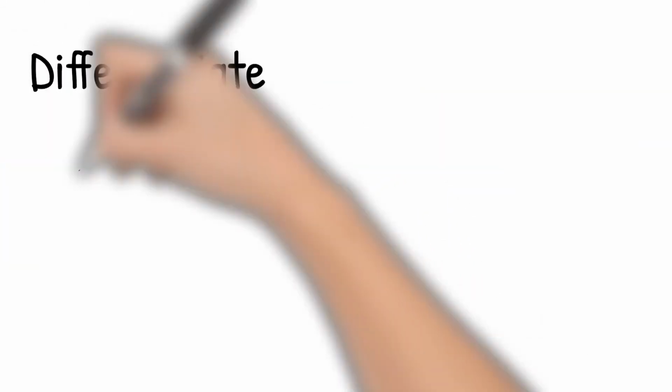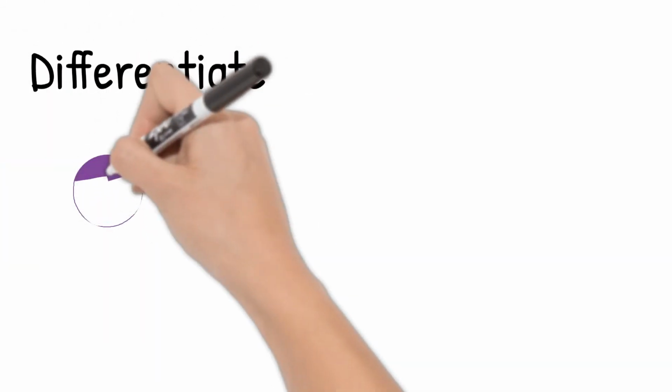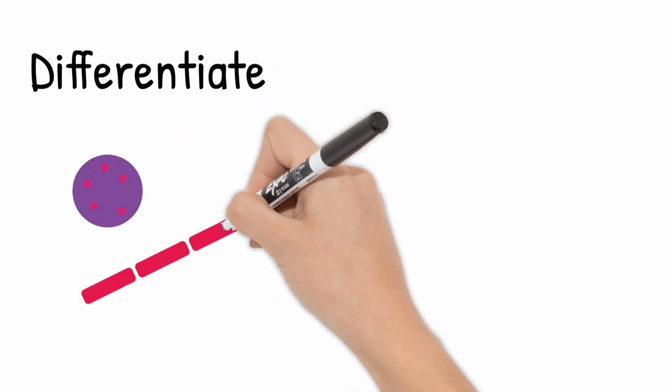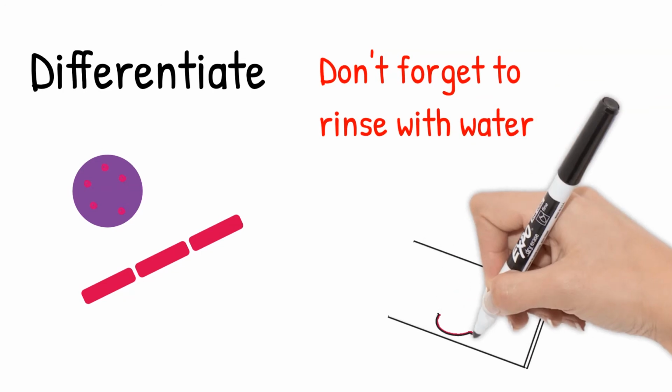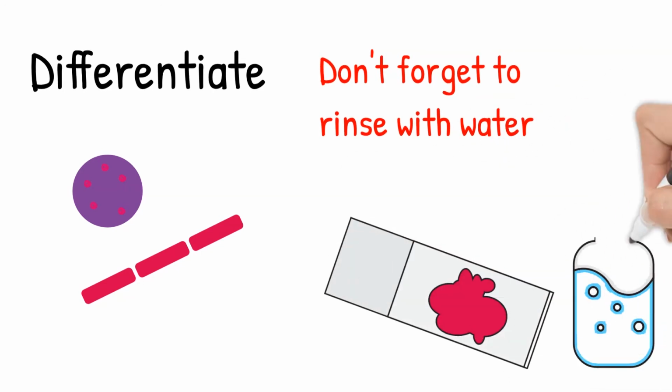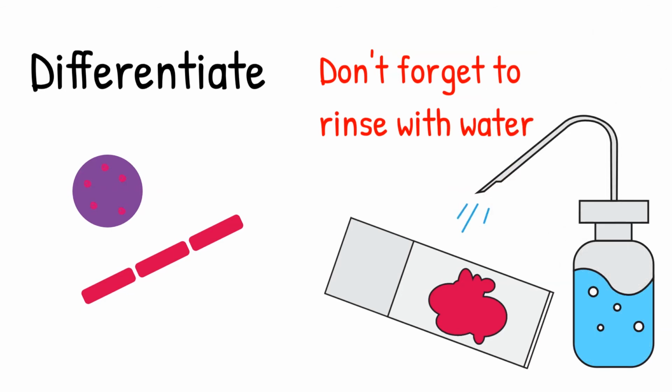Gram-positive bacteria also stain but get overwhelmed by the crystal violet color. Therefore, we still see purple color for gram-positive bacteria. Gram-negative bacteria show red-pink from the safranin dye since they lost the crystal violet dye during the decolorizing step.